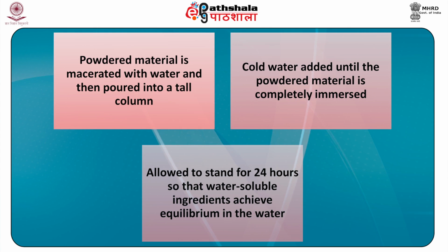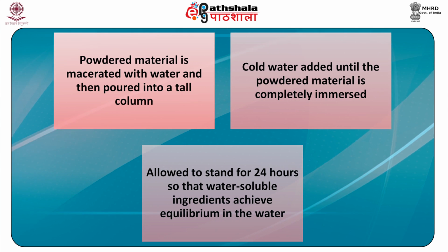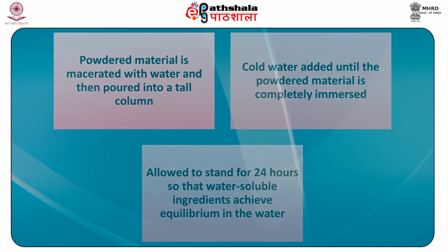It is allowed to stand for 24 hours so that the water-soluble ingredients achieve equilibrium in water. The enriched aqueous extract is concentrated in multiple effect evaporators to a precise concentration. Some diluents and excipients are added to this concentrated extract, which is then ready for medicinal use.